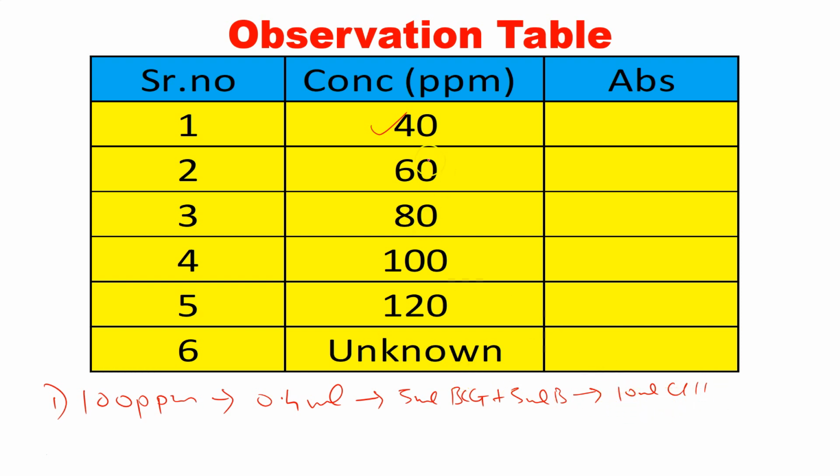Now see how it becomes 40 ppm. The last volume is 10 ml, right?